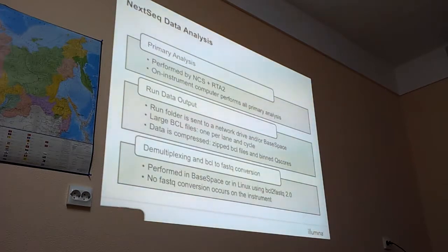So it's still not the standard if you compare it with other platforms. The general standard is usually FastQ. If you want FastQ, and normally this is what you want, you need to convert BCL into FastQ. This can be done either through BaseSpace in the cloud, number one, or through BaseSpace on-site, which you have bought and which unfortunately is still not working, but we will do this in January.